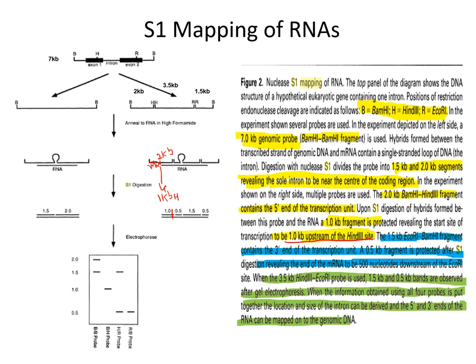Similarly, in this case, the size is 1.5 kb. You do the S1 nuclease treatment, this region which is single-stranded is digested, and the size which is left is 0.5 kb. This region here represents the EcoRI site. That means the end point is 500 nucleotides away from this R. That means 500 nucleotides downstream of the EcoRI is the 3' end.